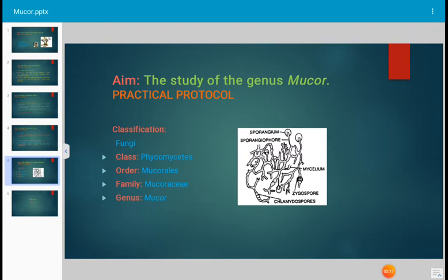This is the figure showing the mycelium and sporangium. Sometimes the fungus produces chlamydospores during adverse environmental conditions. Chlamydospores are thick-walled spores developed mostly under unfavorable environmental conditions, as shown in the photograph.